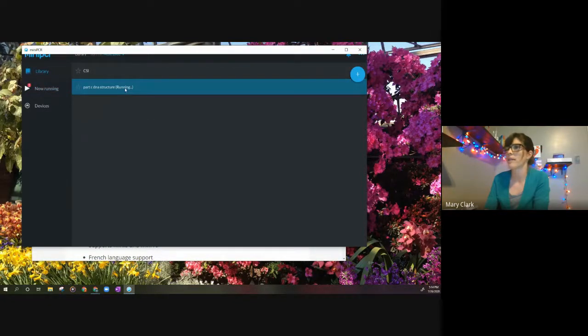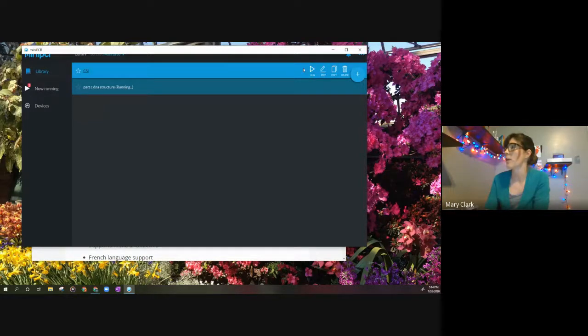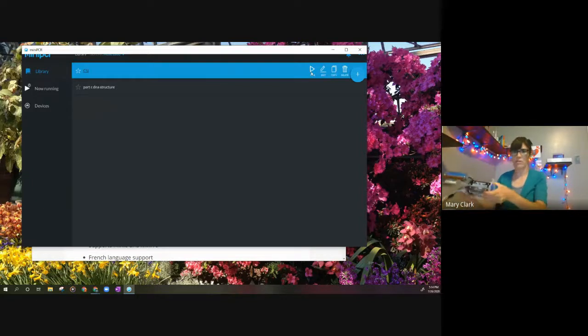Let's go to my library again. Go to CSI, and let's say I want to run this. So for my actual experiment, what I'm going to do right now is just turn this off. All right, so I'm going to open this for my experiment. Let's say I have done all of the pipetting that I need to do. I am going to put in my PCR tubes. I'm just going to pretend right now that these are going in the machine. All right, so those are in my PCR machine now. I'm going to put on the lid, and now I'm going to run that program. So I'm going to go CSI, and I'm going to hit run.